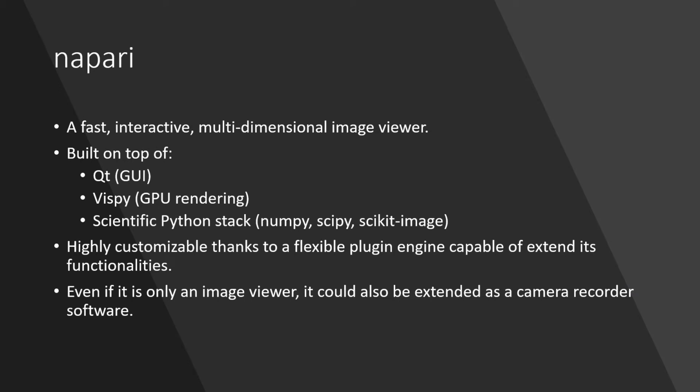As you know, Napari is a fast, interactive, and multidimensional image viewer built on top of Qt for the graphical user interface, VisPy for GPU rendering, and the scientific Python stack such as NumPy, SciPy, and scikit-image. It is a highly customizable software thanks to a flexible plugin engine capable of extending its functionalities depending on the user needs. And even if it is only an image viewer, it could also be extended as camera recorder software, which is what I attempted to do with this plugin.